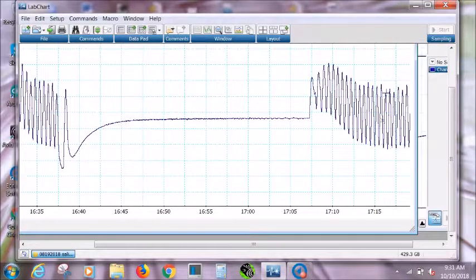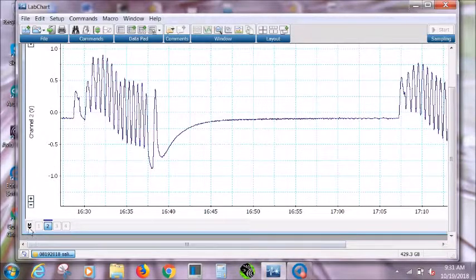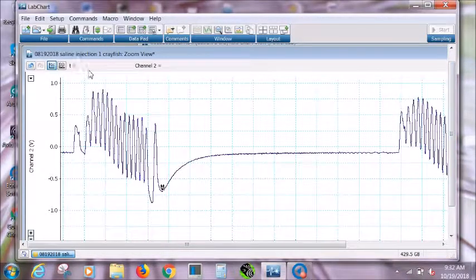You see no peaks or troughs. And how you analyze this is, see this M marker right here in the bottom left-hand corner? You're going to want to put it at the bottom of the trough here. Then you move your mouse all the way along, and this marker serves as a mark for the time. You should see up in this T right here, as you move along, the time changes. So this marker sets the time.